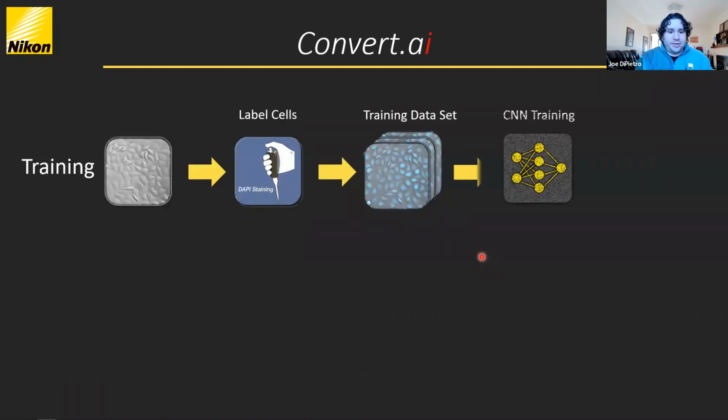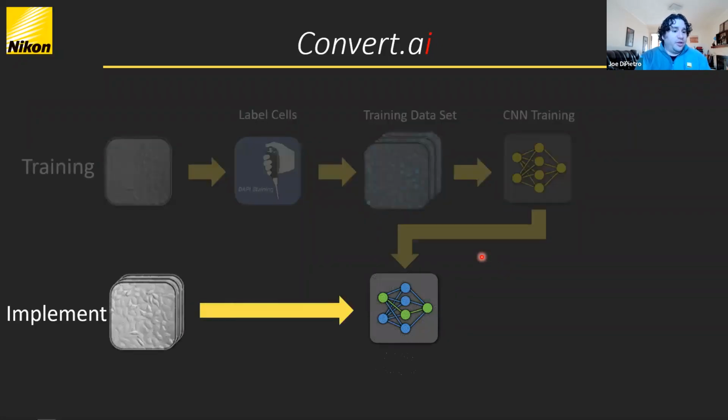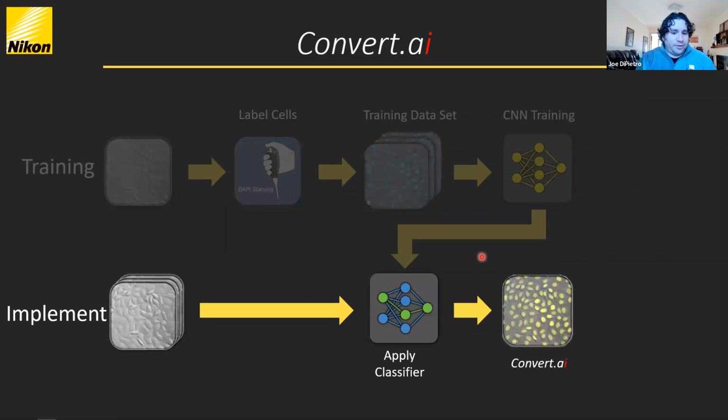So you label the cells, you train it, you have your classifier, then you can just use the cells that aren't labeled and get a labeled image. It's pretty powerful. I think things like this are going to be utilized more and more in circumstances where having the label itself could affect the process that you're studying, right? We know that this is the case.